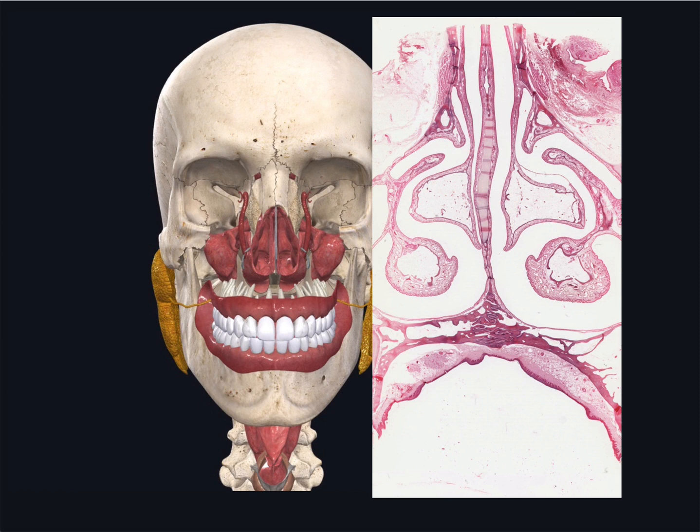The nasal septum is in the midline and is partly cartilage and partly bone. The mucosa of the entire nose is underlain by bone except for this mid-anterior part of the septum, which is cartilage. This cartilage, as I've explained a moment ago, abuts directly with the bone of the bony septum. Further down in the respiratory passageway, the surrounding supporting tissue shifts from being bone to being entirely cartilage.